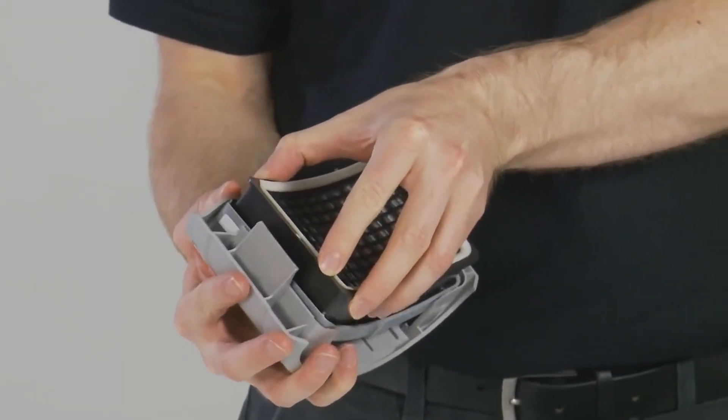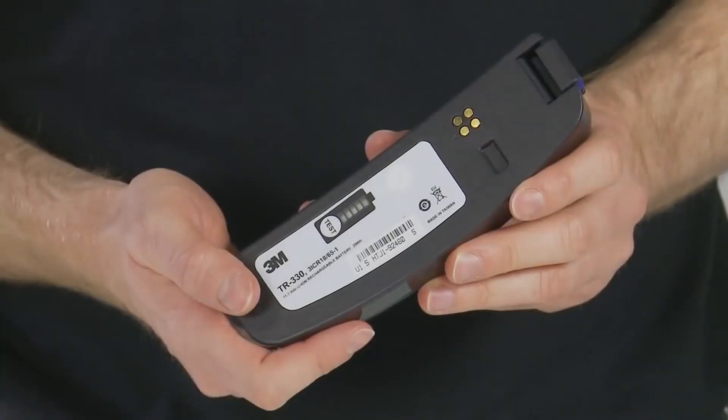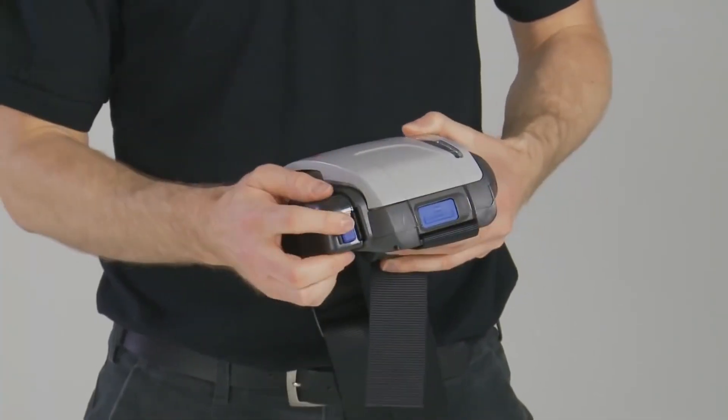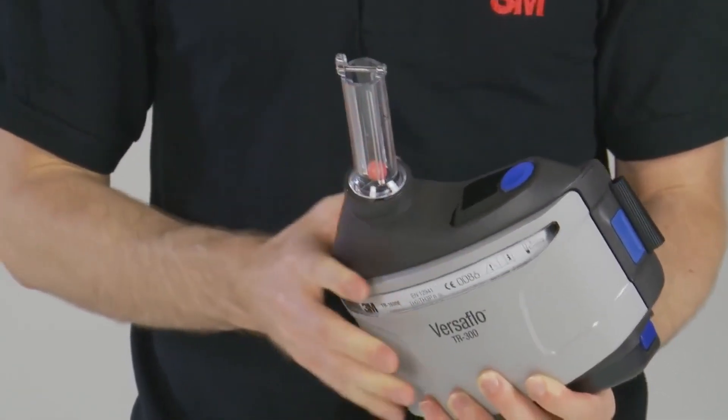Before using a PAPR, confirm the following: maintenance of all parts, the battery is fully charged, and airflow is adequate, typically at 6 CFM.